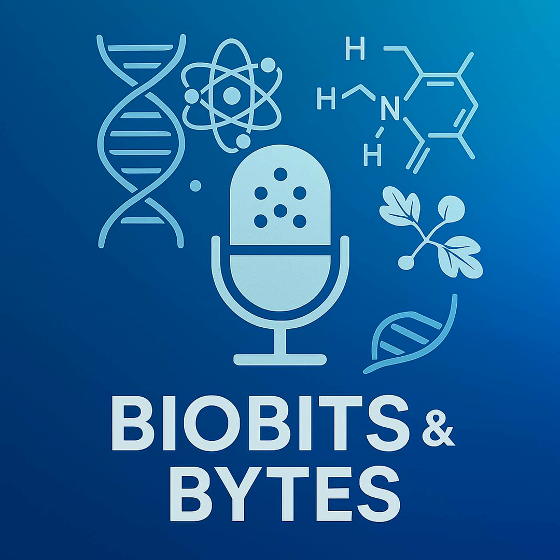Exactly. And competitive ELISA is a bit different. It's often used to measure the concentration of an antigen or antibody. Essentially, the molecule in your sample competes with a labeled version of the same molecule for binding sites on the plate. The more target you have in your sample, the less signal you get from the labeled competitor.